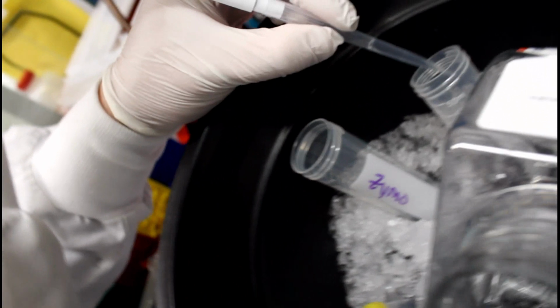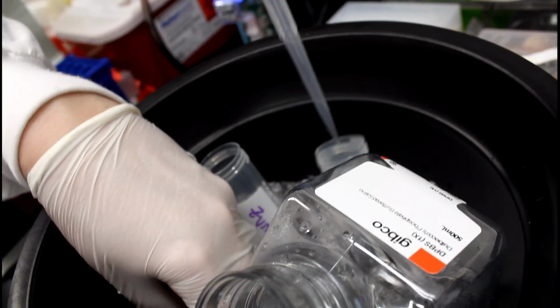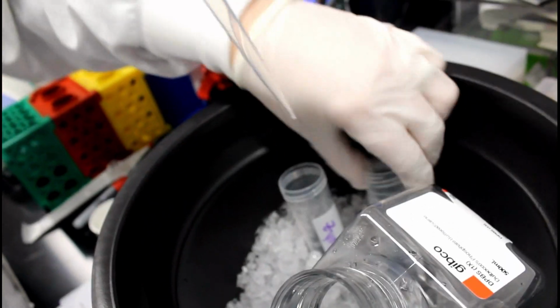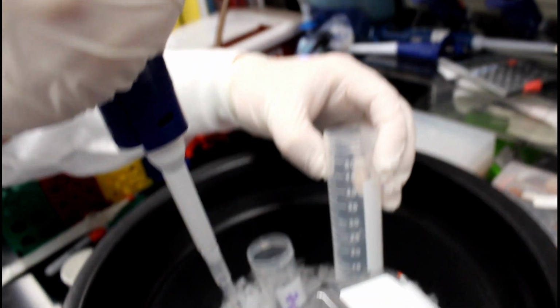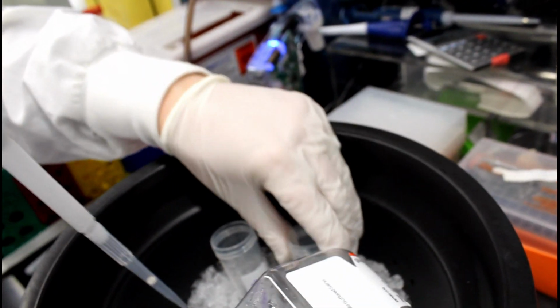This 1 ml volume will be distributed in 2 half ml aliquots for storage. These 2 samples will be stored at -80 degrees Celsius.